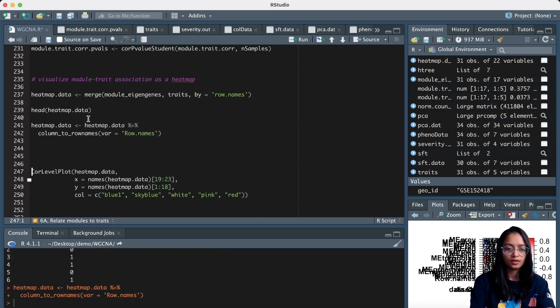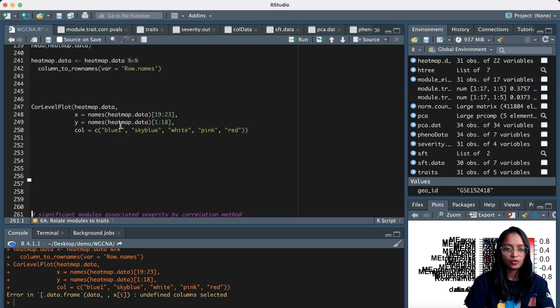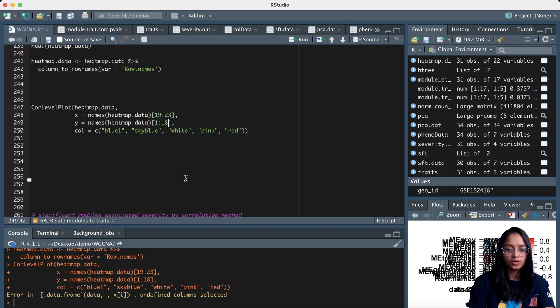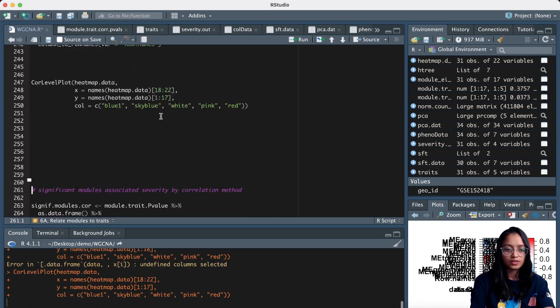Now let's run this again. We also need to adjust for the number of columns since the column ranges have shifted, so we subtract one from the column ranges.